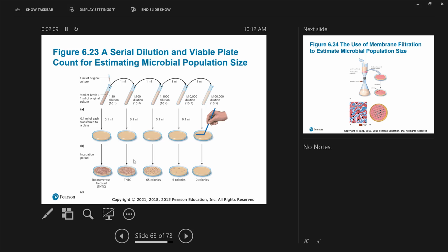In the same way, in the lab, 1 milliliter of a liquid broth culture is going to have millions and billions of cells in it. You cannot possibly count that on your own, but you still want to know a ballpark estimate of what is in that 1 milliliter of undiluted sample.